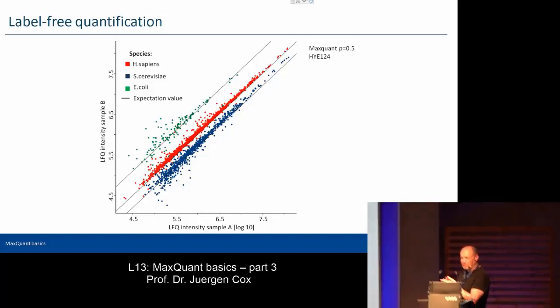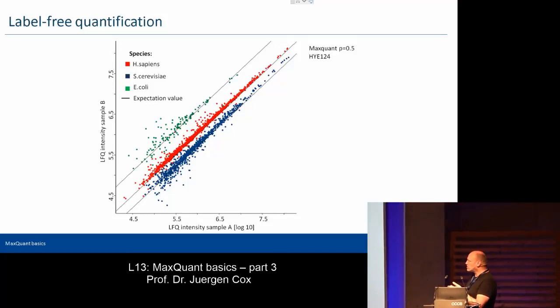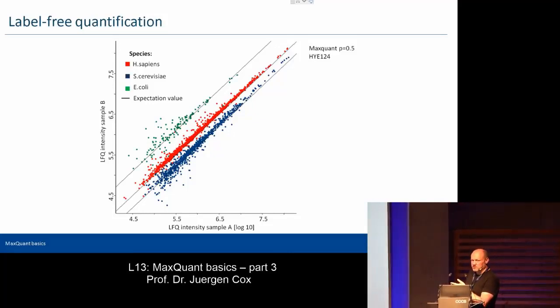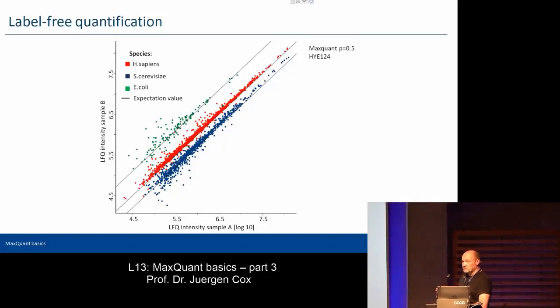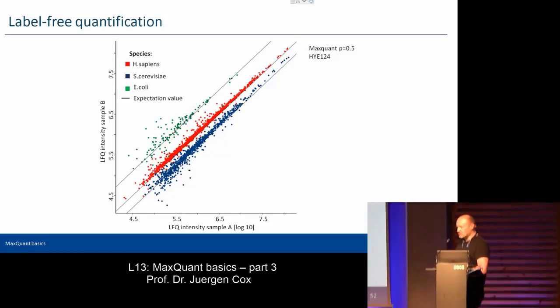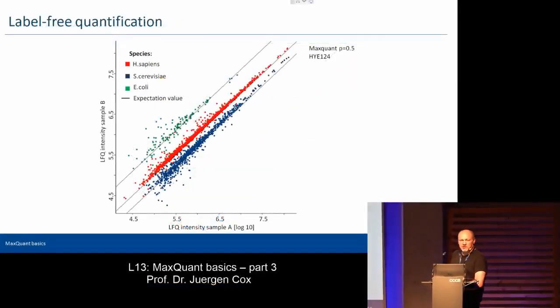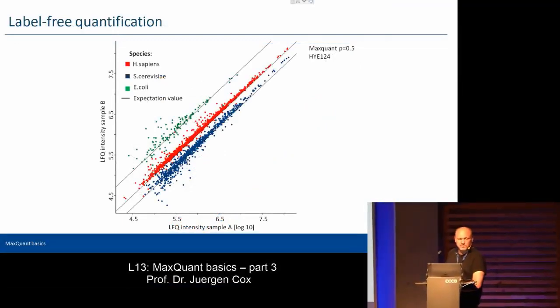One small thing that is also missing yet is support for Linux. That's a general feature of Bruker data, that it's absolutely possible. We just haven't done it yet. So be patient, a few more days or a week or 2. Then there will be a new version where you can also run the ion mobility workflow on Linux machines.